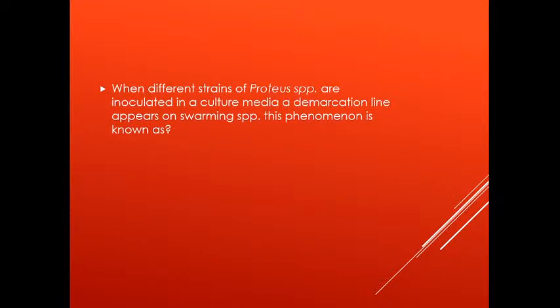We have what you call Dienes phenomenon. Now, Dienes phenomenon is when two different strains of Proteus species are inoculated in the same culture media, they would form a demarcation line. So for example, both of these organisms are Proteus species. Much like in many laboratories right now, they save culture media. So they use half of the culture media for one specimen, and the other half has a specimen from another patient. So that's really the case in some hospitals. I've experienced it mostly in the Philippines.